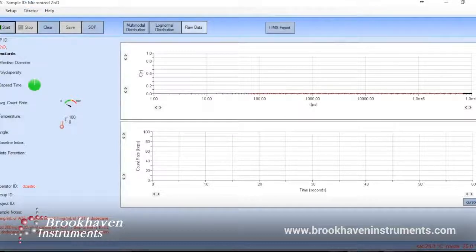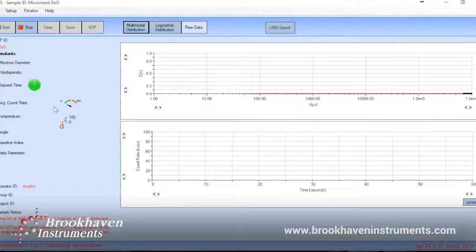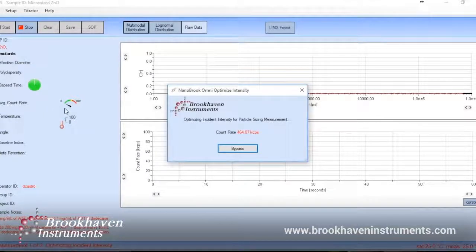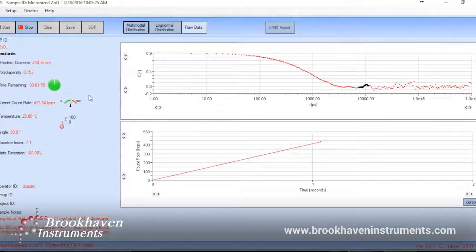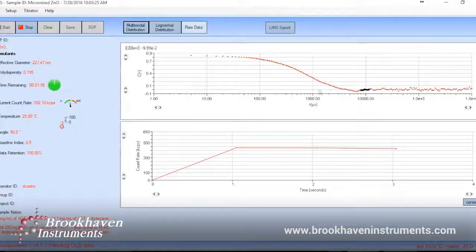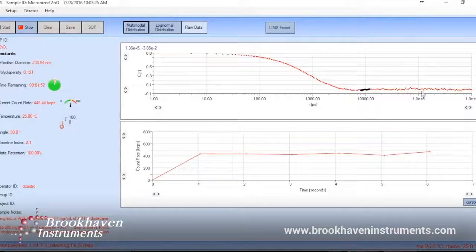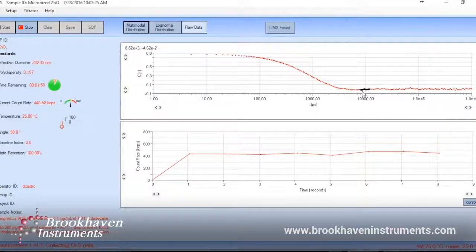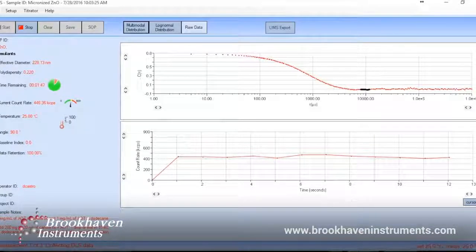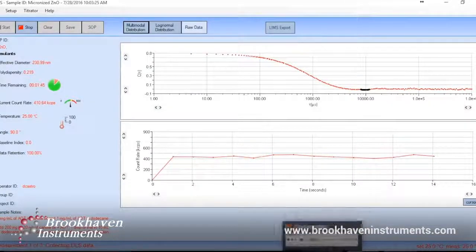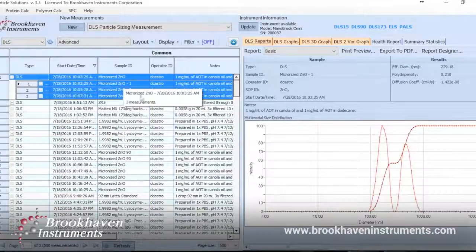Now we can click start in the main measurement window. The measurement will begin and show the raw data as an autocorrelation function of the scattered light intensity due to the fluctuations arising from the diffusion of particles. Size is calculated from the diffusion coefficient. A smooth function with a flat baseline is the signature of a good sample and suggests that repeatability will be good. At the completion of each round, we can see the results are automatically saved into the front-end database for easy access.